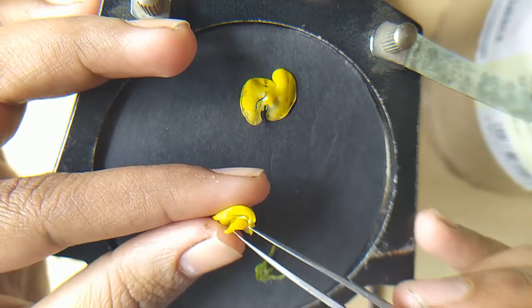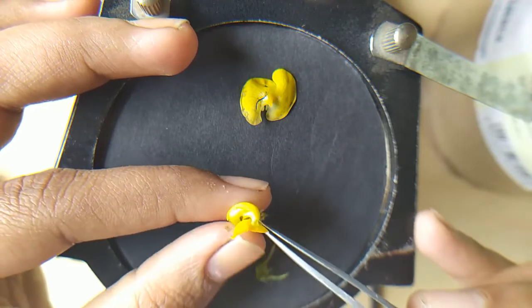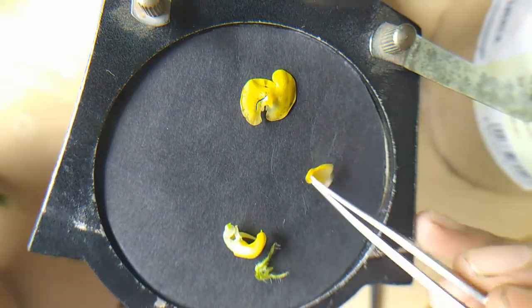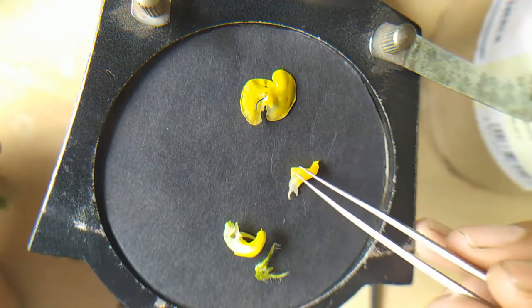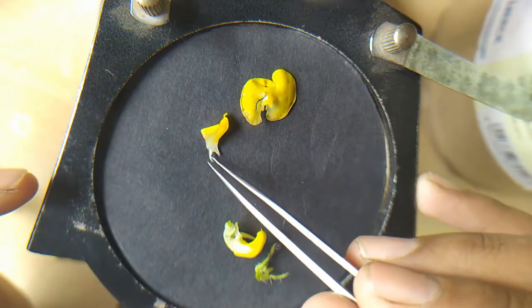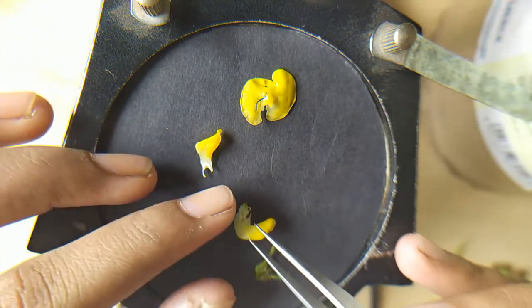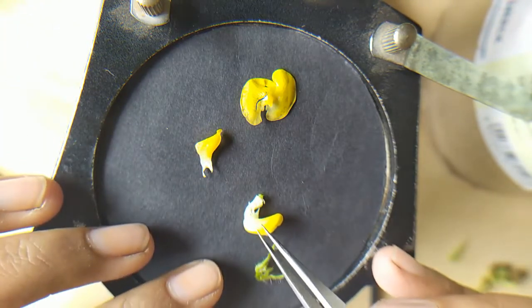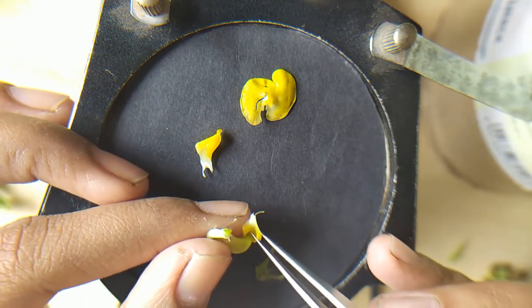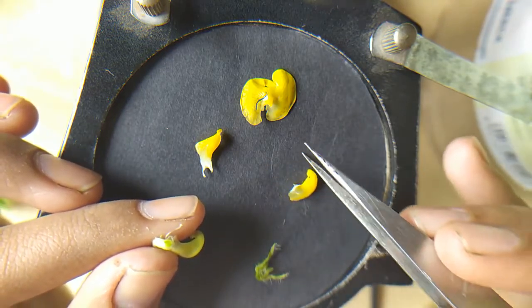After the standard petal there is a presence of a pair of wings. So I have removed one wing here. I will place the same here. Then remove the other side of the wing. Now the other side of the wing is removed by me.